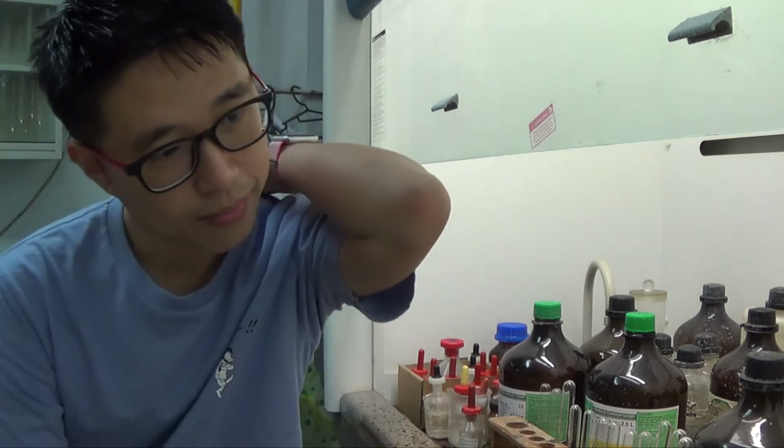Okay, so this is my fume hood. We'll be using concentrated hydrochloric acid as well as concentrated ammonia. These things are corrosive because of the high concentrations, and for safety reasons we have to do them in the fume hood because they fume, they produce vapors which are very toxic to you. They are corrosive as well, so you don't want them burning your lungs.